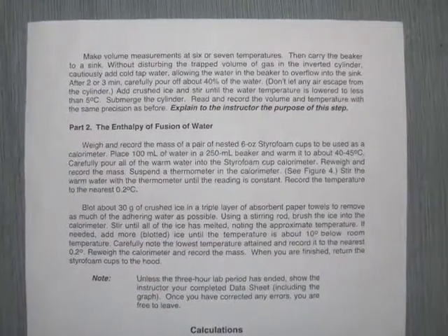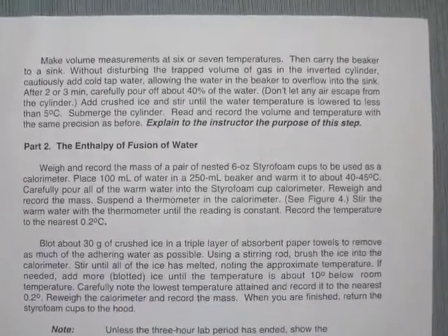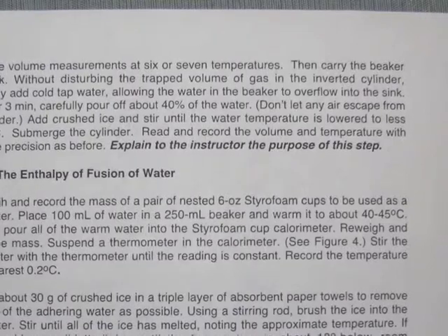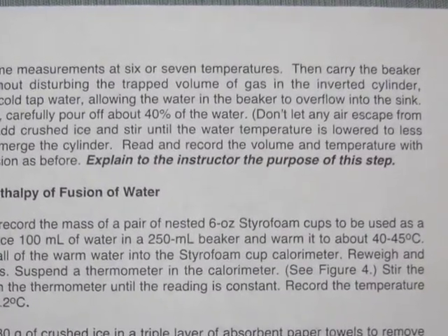Later we draw on this explanation, for which the student has already received a red check, to understand why the calculations are structured the way that they are. Here, crushed ice has been added to the apparatus to lower the temperature of the bubble to near 0 degrees Celsius. Why is it important to measure this volume so accurately?